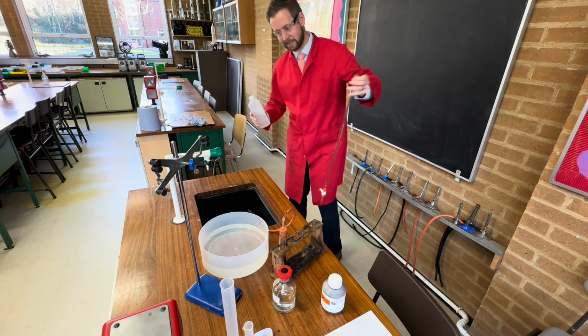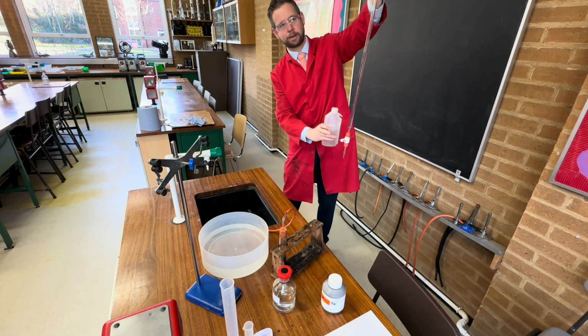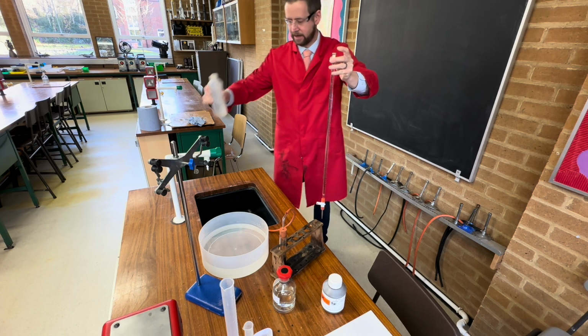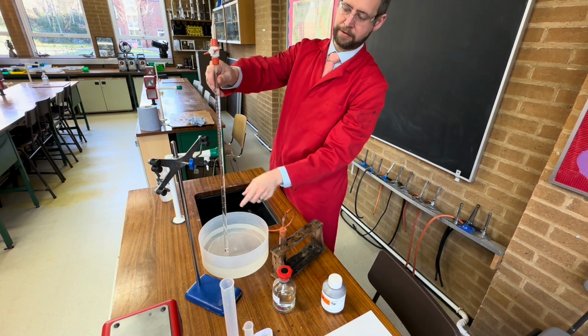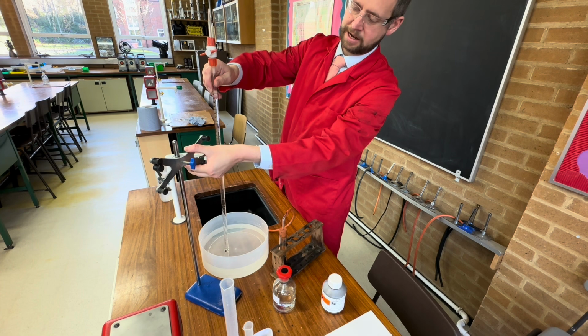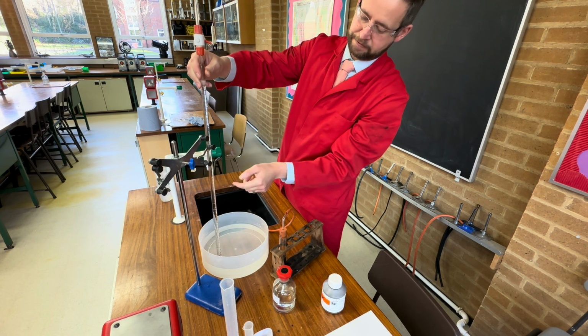You won't necessarily get this under a tap, so you need to just make sure that it's closed down here, and then you can just refill it with some distilled water. Don't have to be too accurate here on the top because, well, I'll show you. When we flip it upside down in the water with our finger on, don't worry if you get the odd bubble going to the top, because with this one, what's going to happen when we clamp it in place, we want to clamp in place so that we can see the scale facing us.